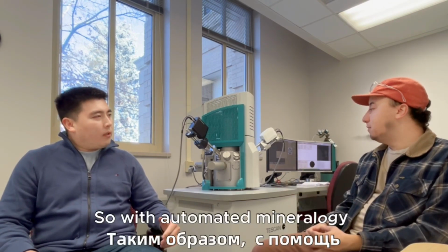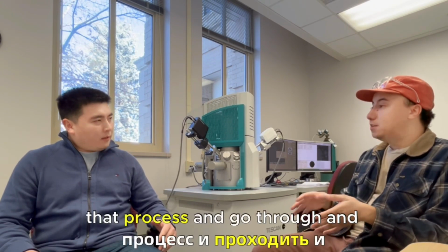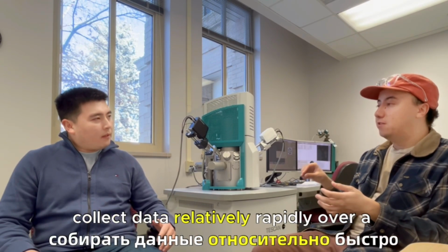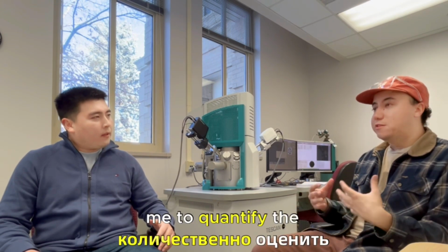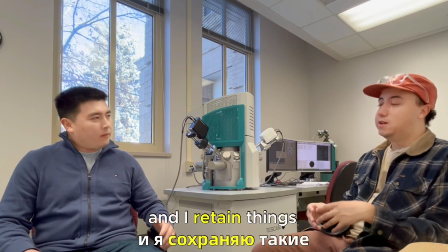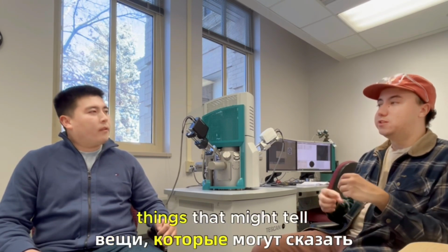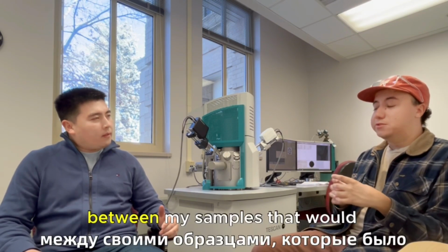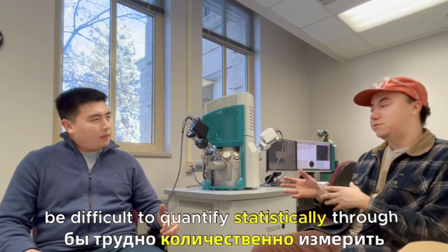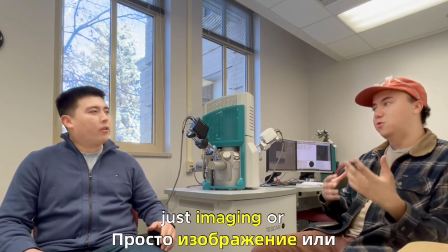So with automated mineralogy, we're able to automate that process and collect data relatively rapidly over a large area. That allows me to quantify the mineralogy of an entire sample. And I retain things like the textural characteristics and the grain size distribution, things that might tell me more about differences between my samples that would be difficult to quantify statistically through just imaging or microscopy.